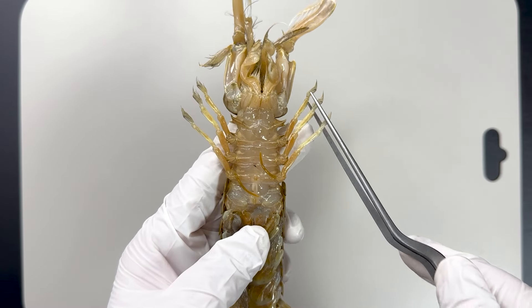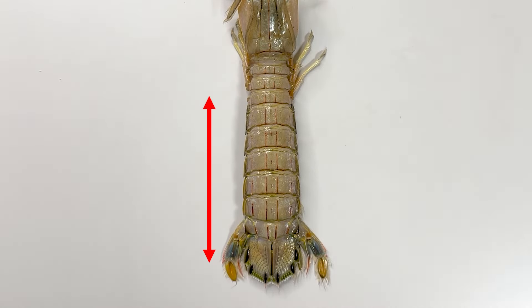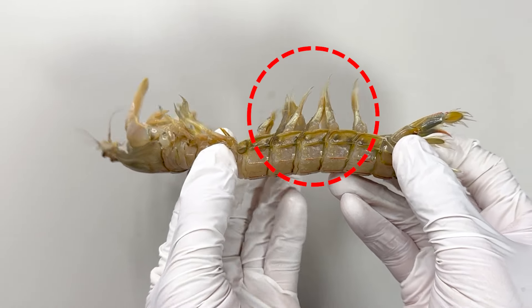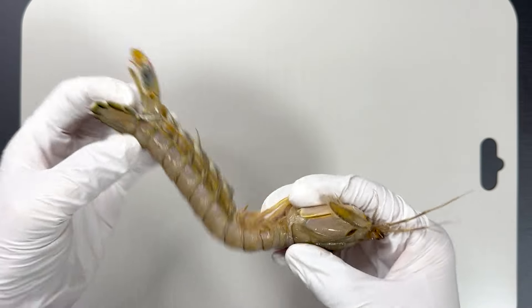These three pairs of legs on the thorax are used for walking on the seabed. This elongated part at the back of the thorax is the abdomen. From the side, you can see the five pairs of pleopod swimming legs. The arthropod body is segmented like this, allowing for flexible movement.